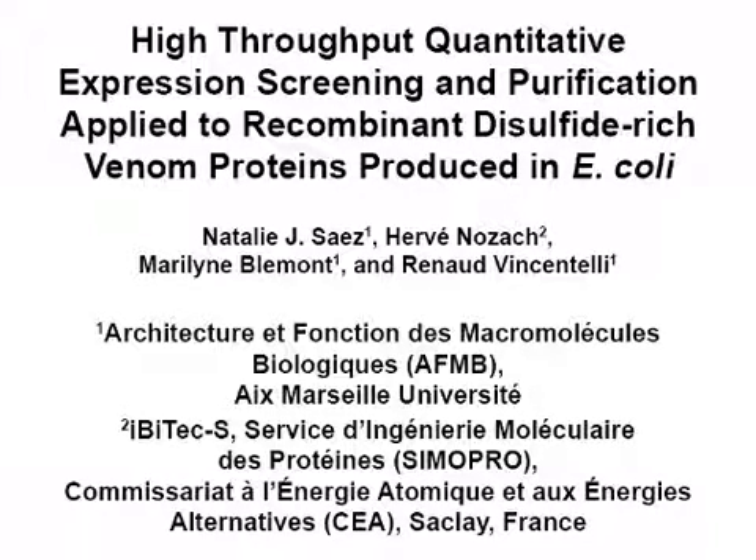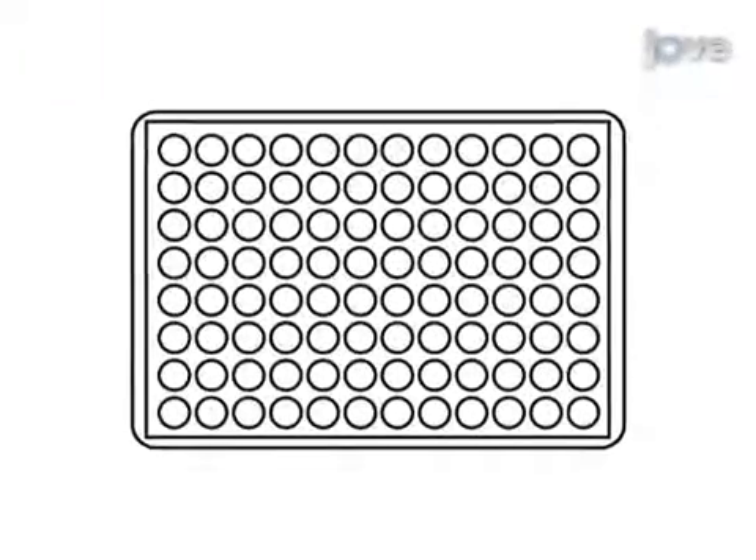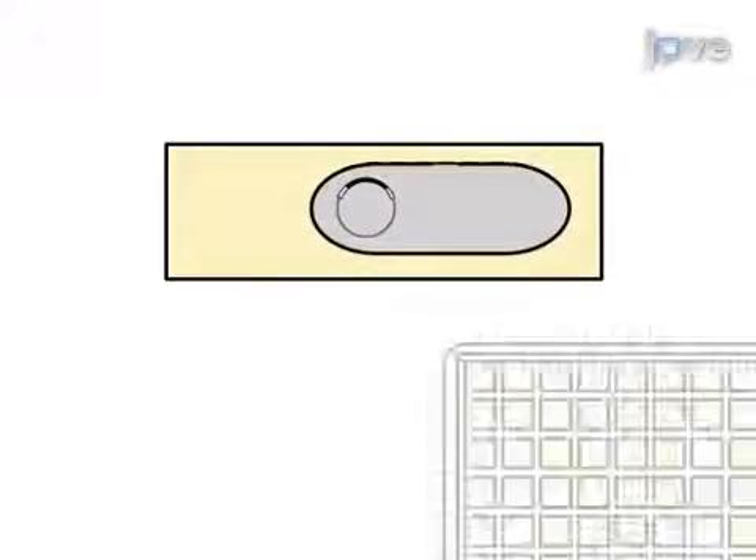The overall goal of the following procedure is to use a high-throughput expression screening protocol to quantify in E. coli the level of soluble proteins using an automated liquid handling robot. This is accomplished by first inoculating 96-well precultures with cells transformed with plasmids encoding the target fusion proteins.